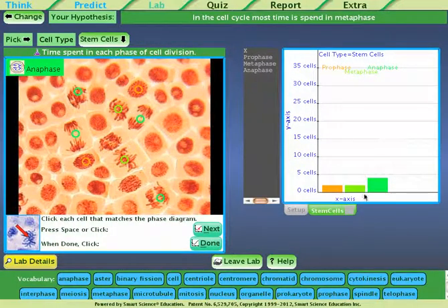And you can see the anaphase over here on the graph. Now I will go ahead and do telophase. I don't see a whole lot of those. There's a possibility for one of these two, but I'm uncertain, so I'm just going to skip on. Lastly, interphase. And this is any time that I can clearly see a circle nucleus within the cell.